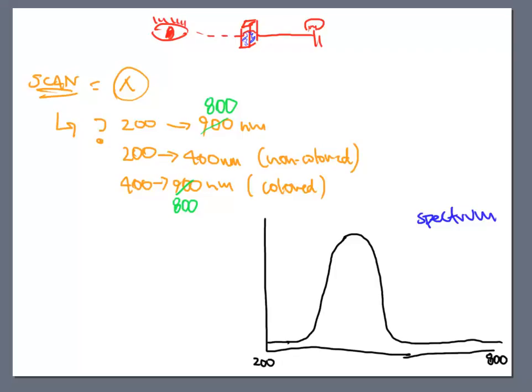Okay, well, at the top of this peak, that is a very important point. The top of this peak is the maximum. And if I draw a dotted line straight down, right here, that is the food item that it enjoyed. That is the wavelength that it really, really liked.